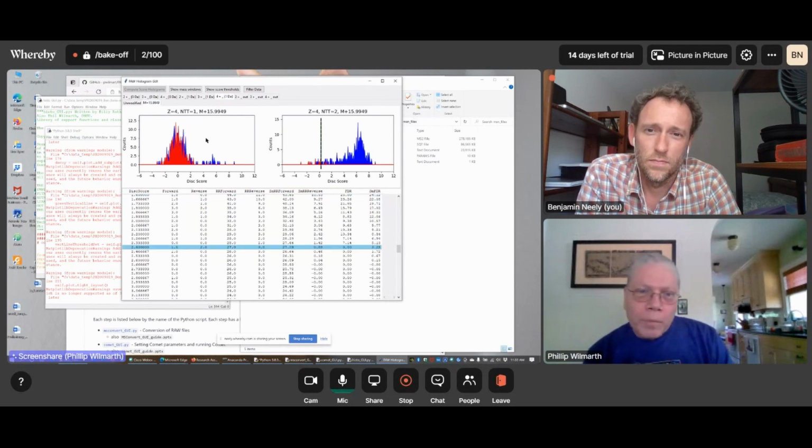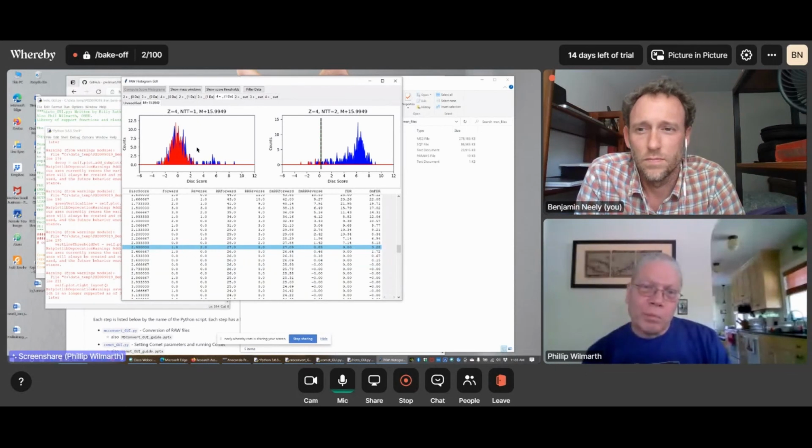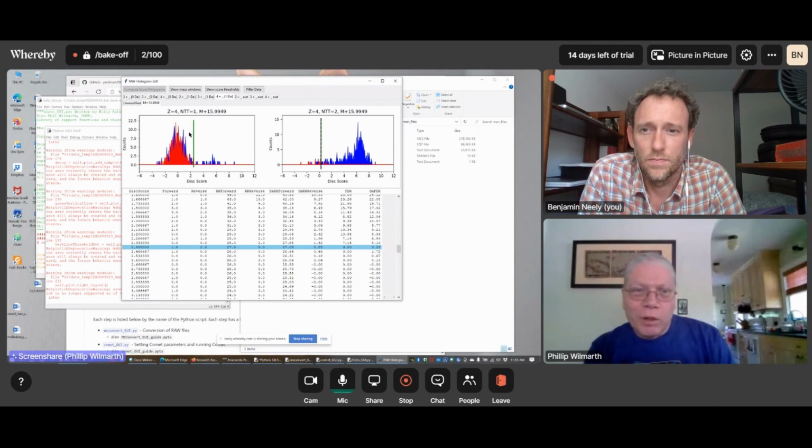Now here's an example where we had fewer than 50 counts above our 1% cutoff. So any sparse category like this doesn't get a threshold set at all. It's just excluded as a conservative sort of thing. But if we want to play the game of trying to maximize things, then we can just click on the table. It'll show us where the dotted line is just above the decoy distribution. And if we hit the return key, then we get the dotted line on top of the green line. And then we'll be capturing those 27 additional correct IDs. So that's pretty much how you set the thresholds and score distributions.